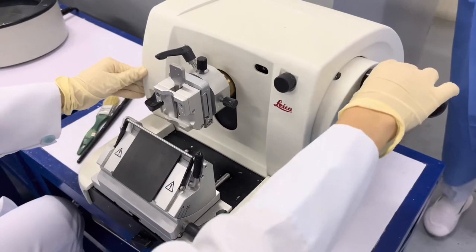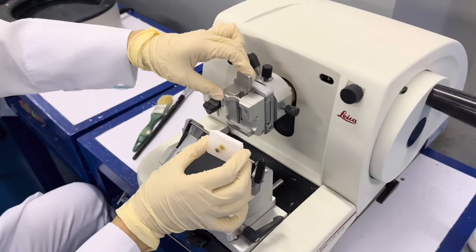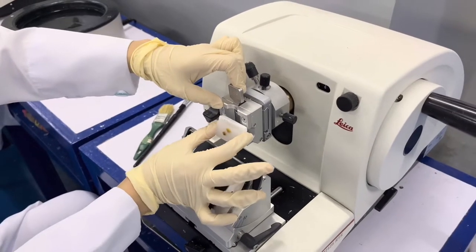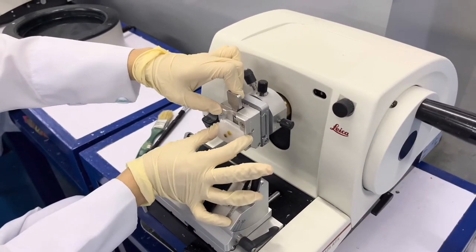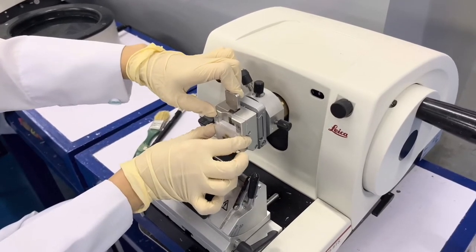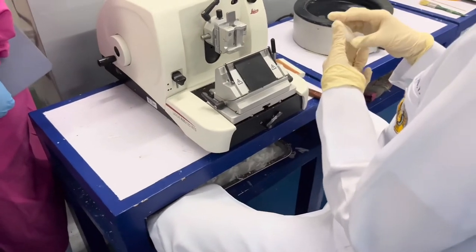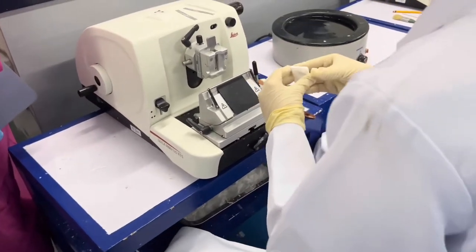Lock the rotary wheel and its lever, then gently pull back the tissue block holder. Put the tissue block into the tissue block holder and you're done with the microtome setup. For this video, I'm going to demonstrate how to trim the tissue block.